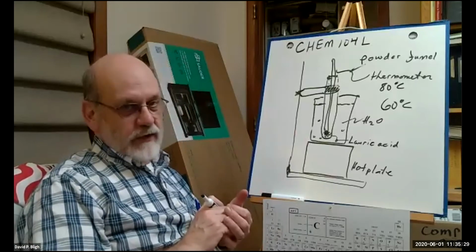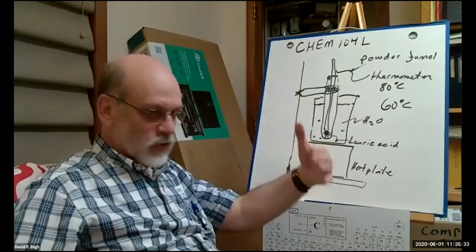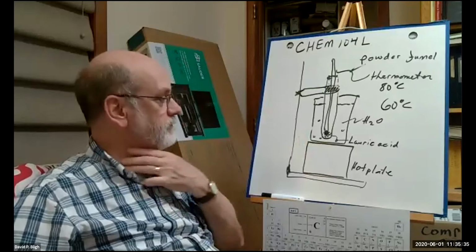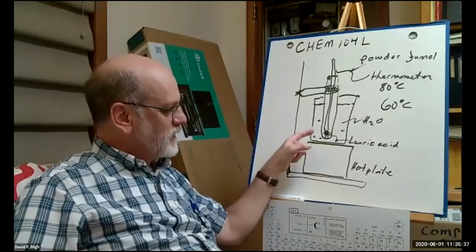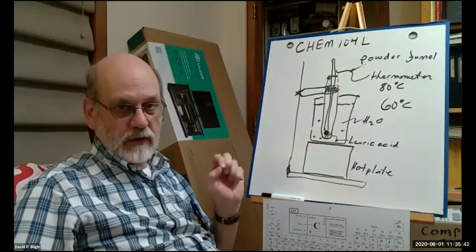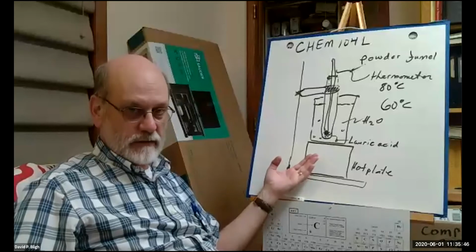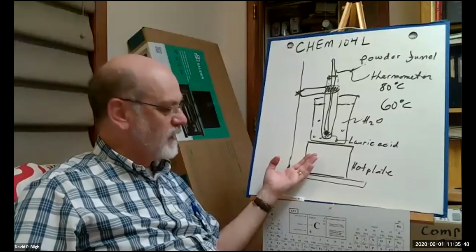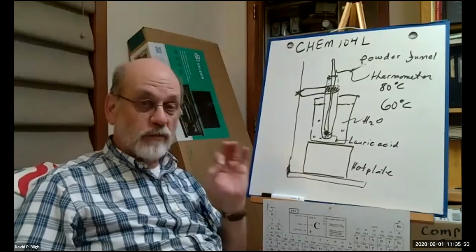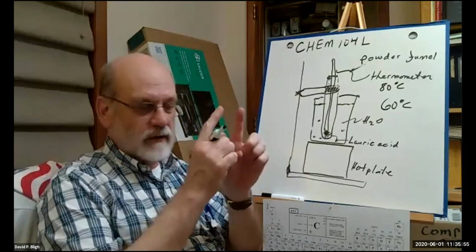And you do that every 30 seconds. And it's going to gradually get cooler, cooler, cooler. And at some point, you're going to notice in that liquid, you start to see little crystals form of the lauric acid. Now, what you don't want to do is be fooled by crystals forming around the top of the solution.